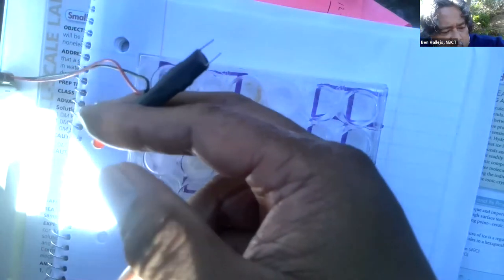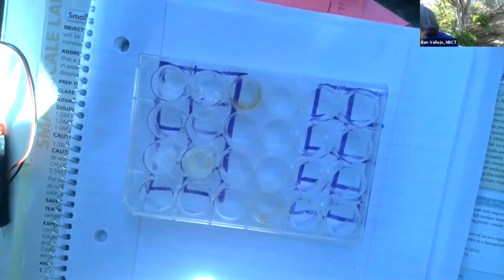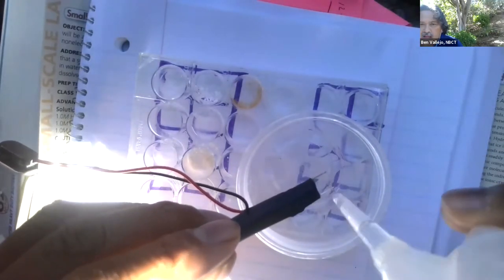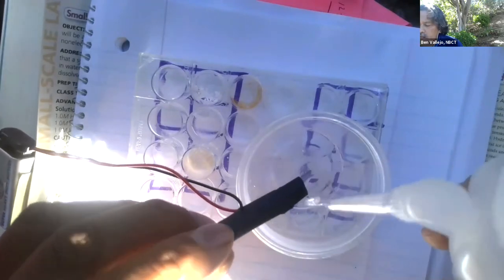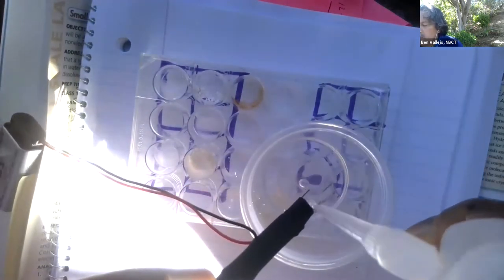Ideally, what you would do in the laboratory is you would have your squirter bottle like this, right? You have one of these. I tend to not like these because as they sit with the water pressure, sometimes they start leaking out the tip. The ones I have in my lab room tilt kind of up. This one tilts downward, and you can't really change it on this one. So there's that. And then I'm going to take my conductivity tester and rinse it off with distilled water. Like that. Okay. And even when I'm not using it, you should keep it in there or keep it totally dry.